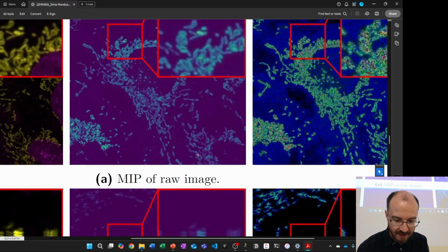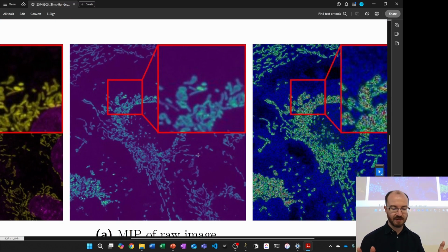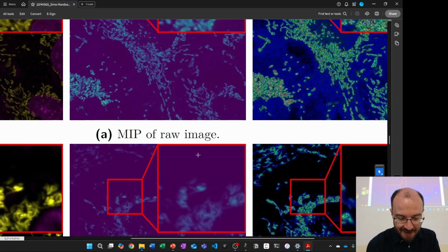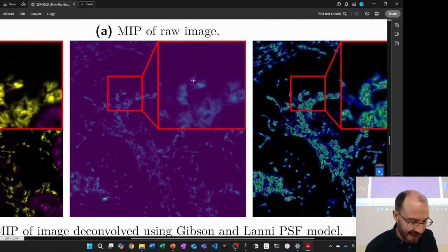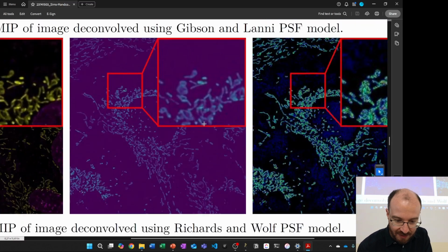And then we first checked, okay, if we apply a specific deconvolution method, what point spread function generation should be used? Because we are going to artificially estimate this point spread function. We don't know what is the best one for our microscope, so you just try all of them. For this point spread function generation, it destroyed my image, so not great. This one's reasonable.